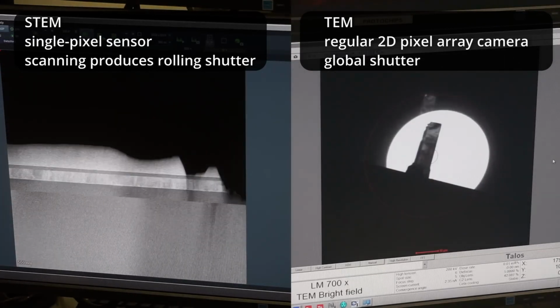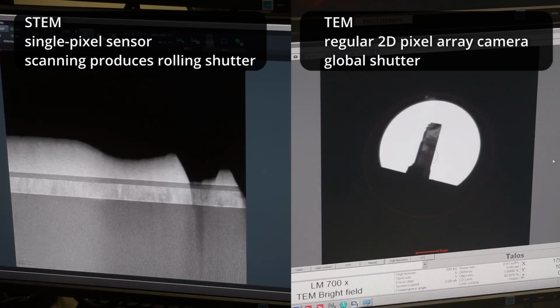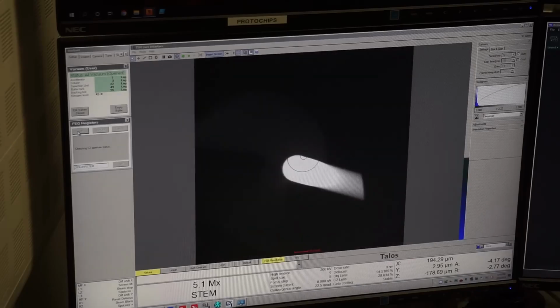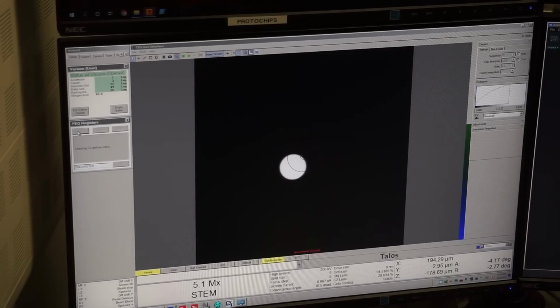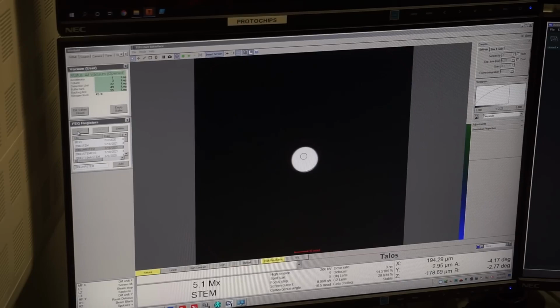It's actually scanning the electron beam back and forth, line by line, to rebuild the picture. The real trick now is that the beam needs to be focused to as small a point as possible. If the beam can illuminate multiple atoms at once, then you just get a blurred out signal because you're always hitting something with the beam and always letting some of the beam through.